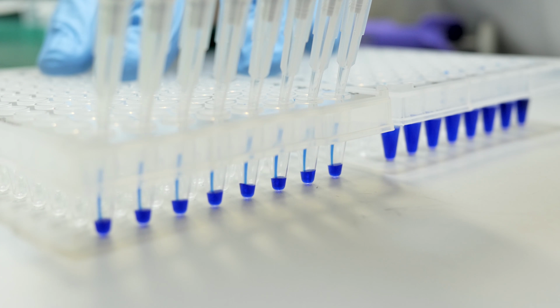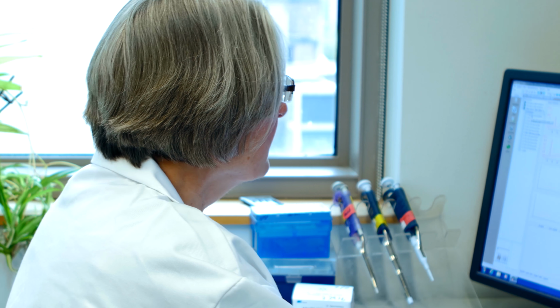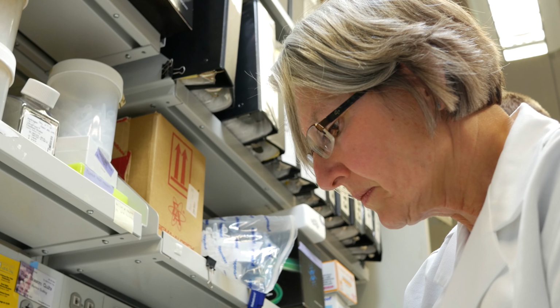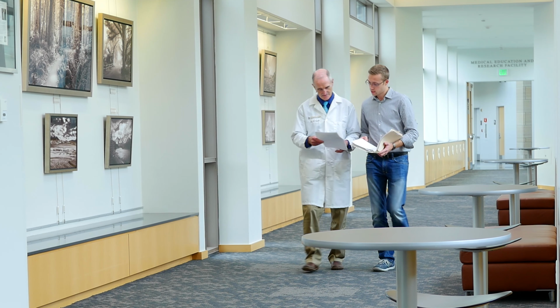The targeted capture approach allowed us to evaluate more samples at one time, pool more samples in one pool, and evaluate more subjects at one time with a lesser cost. The platform is really, really powerful. We can detect CNVs, or copy number variation, that involves a single exon, whether single exons dropped or duplicated, plus really large copy number variants.